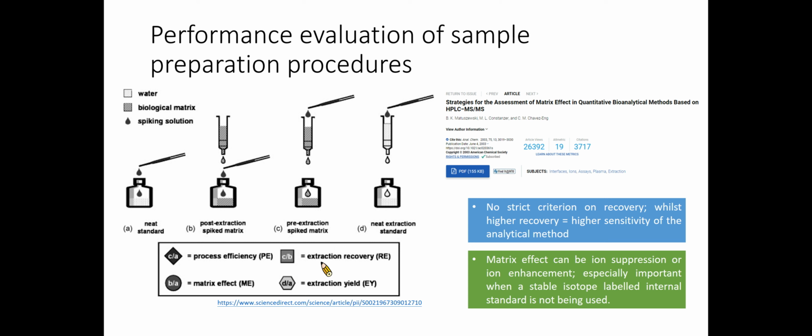Residual compounds still present after sample preparation can interfere with the mass ionization process, leading to the well-known signal suppression or enhancement situations. The influence of endogenous compounds on LC mass, or matrix effect, is evaluated by the ratio of peak area from the matrix sample fortified after the sample preparation and the neat standard.